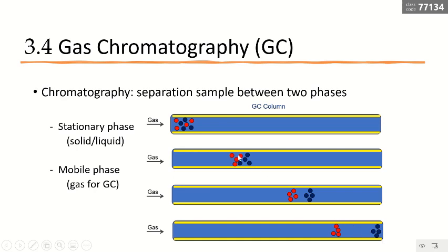By such a running process, the faster runner reaches the ending point first. The time keeper notes who reached first, the second fastest, the third fastest. They can be separated. That is what chromatography means.